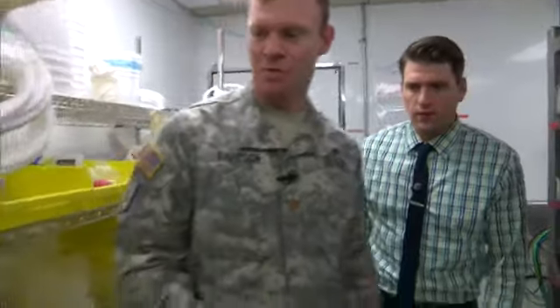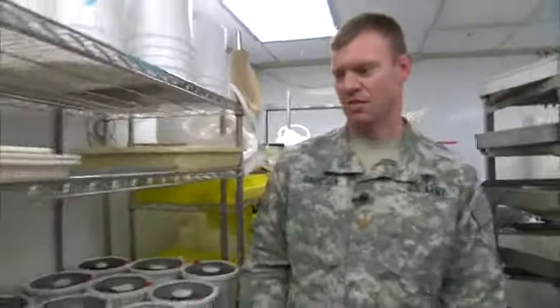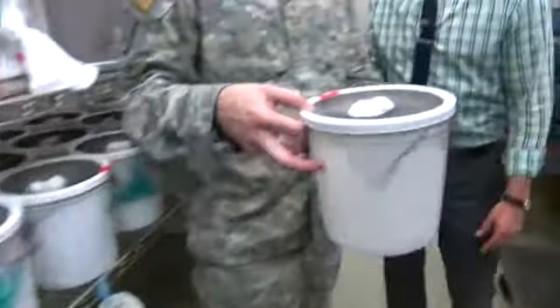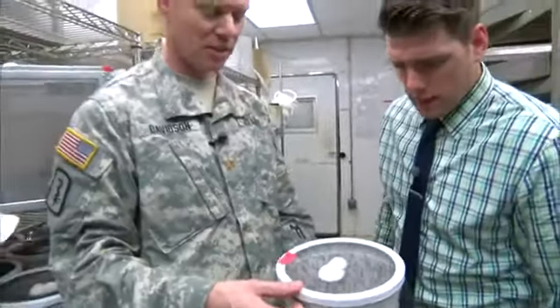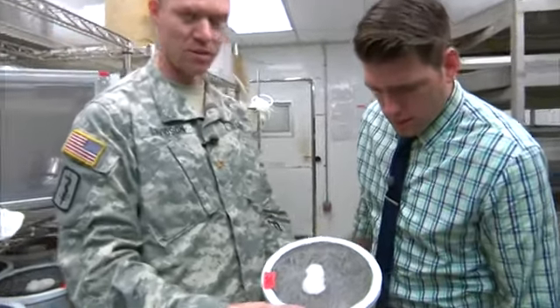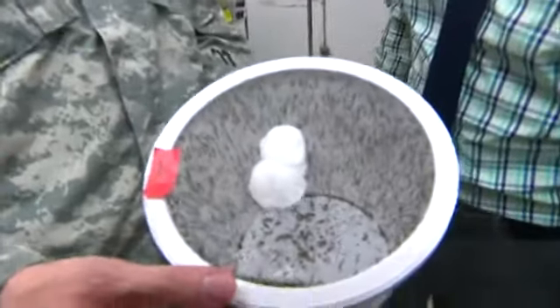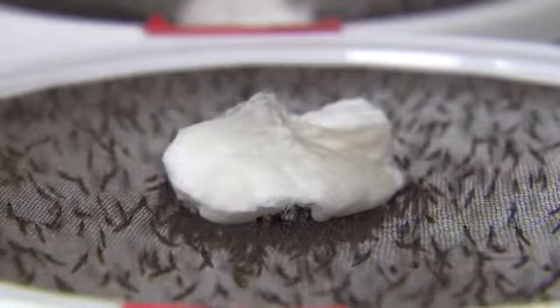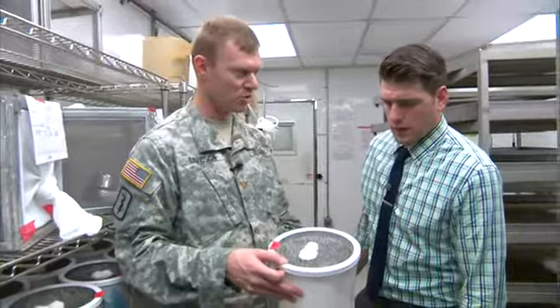After we take the pupae out, we put them in these plastic cartons. So I'll show you one down here that has just had pupae added to it. So yesterday, you can see the adults are already emerging, and there's probably 300 to 400 adults in each of these cartons. We have males and females. We add these cotton balls at the top that have sugar water added to them, so that's what they both feed on for the energy source.